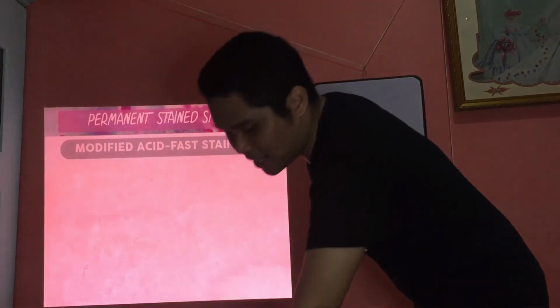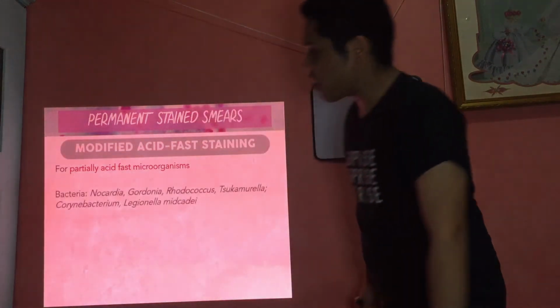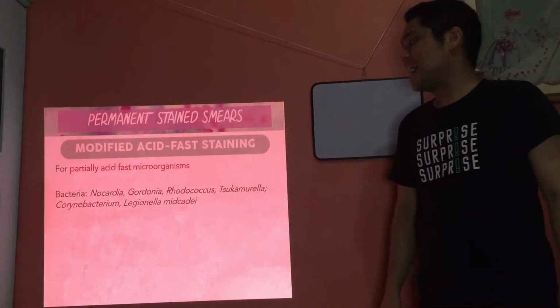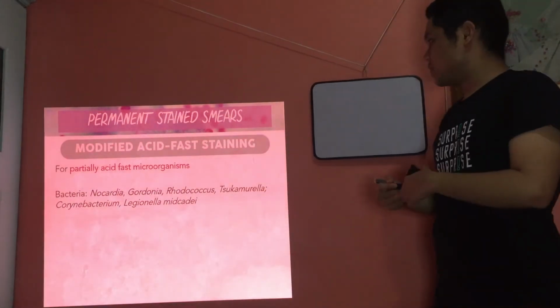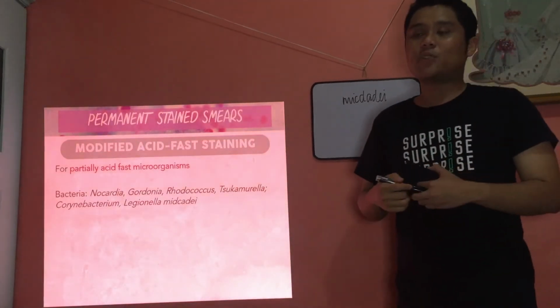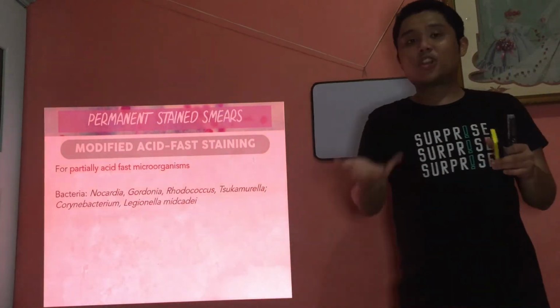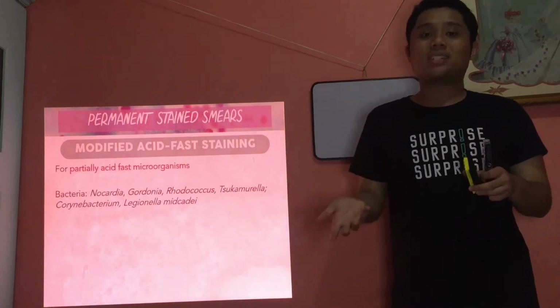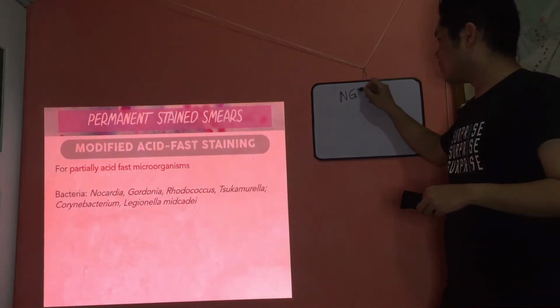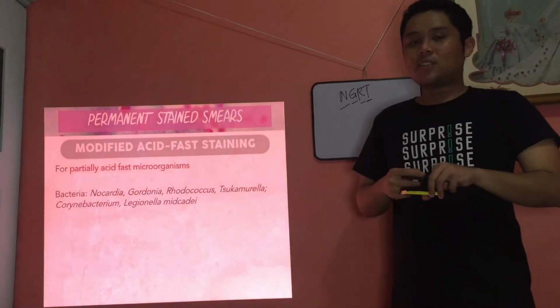For modified acid fast, we use this procedure for, again, the partially acid fast organisms. Those are Nocardia, Gordonia, Rhodococcus, and Tsukamurella. Corynebacterium and Legionella micdadei. These bacteria are partially acid fast, meaning they have mycolic acids in their cell wall but in a lesser content compared to Mycobacterium, which is the true acid fast. My mnemonic for partially acid fast is NGRT: Nocardia, Gordonia, Rhodococcus, and Tsukamurella.